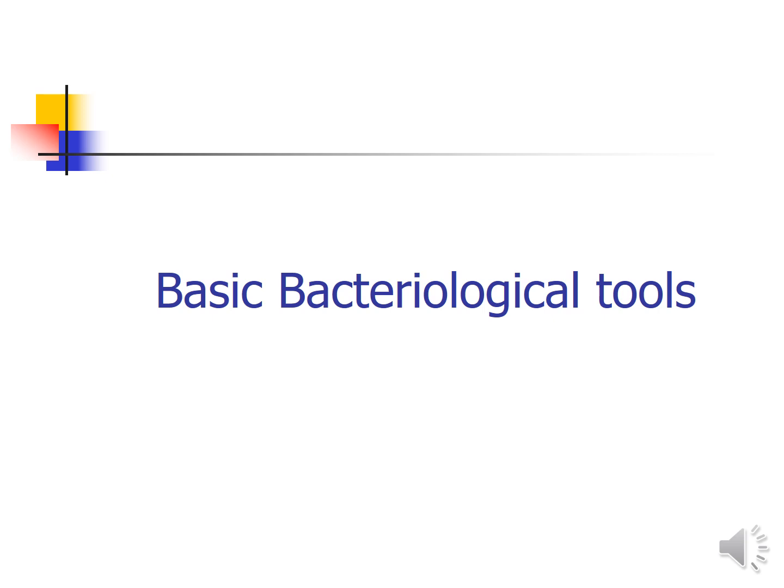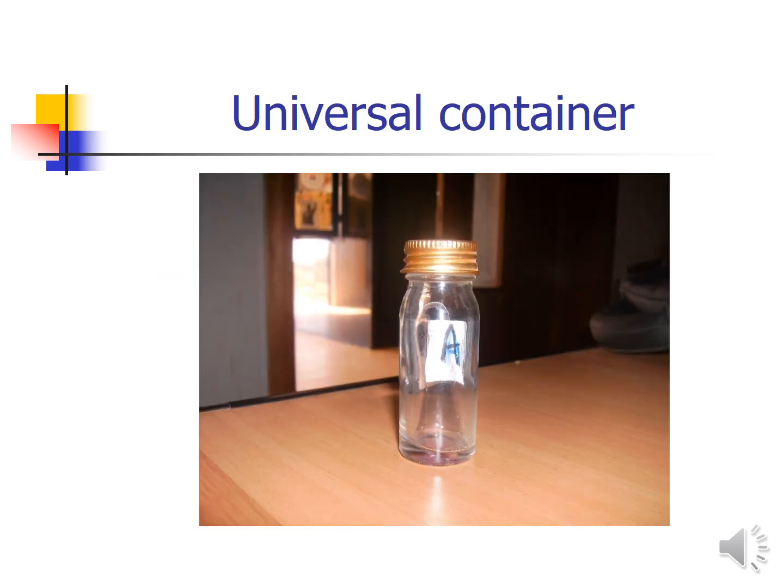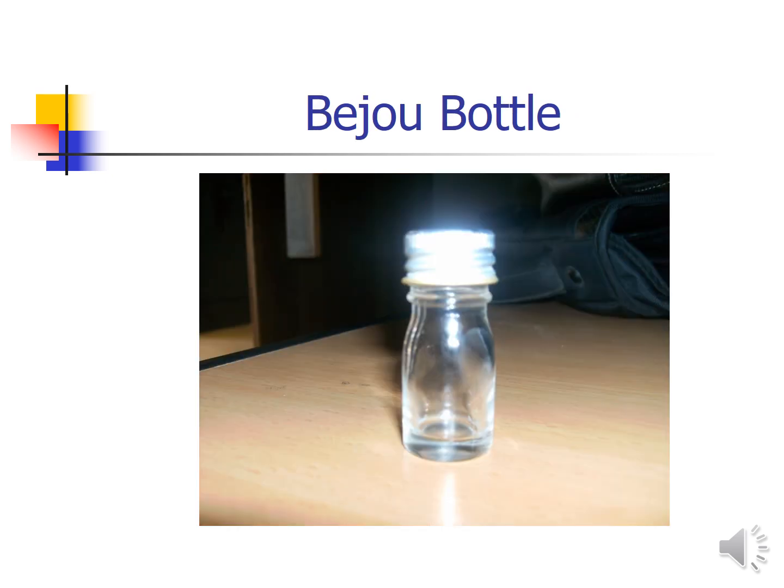Good morning students. Today we are going to discuss a few bacteriological tools from an exam perspective. So this is a universal container. This is used for urine collection as well as for sputum collection. Okay. You can also have plastic containers. So this is a screw cap container. Okay. Fine. Next, this is a Bijou bottle.